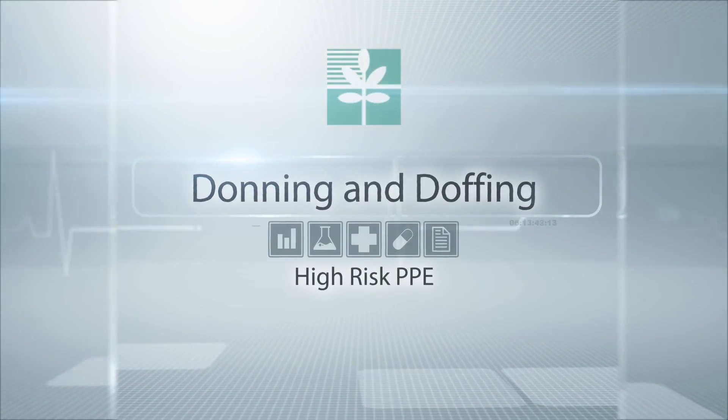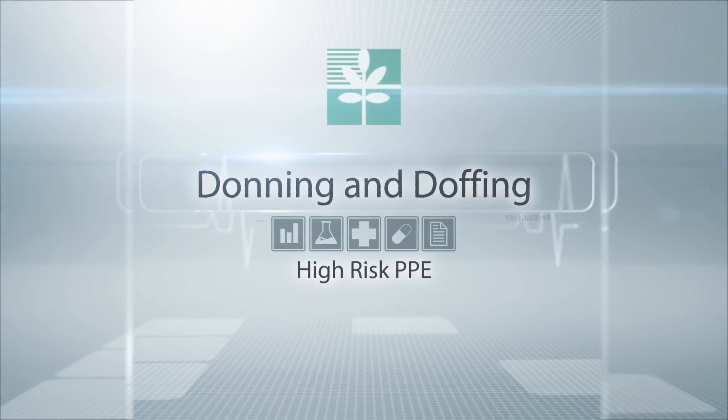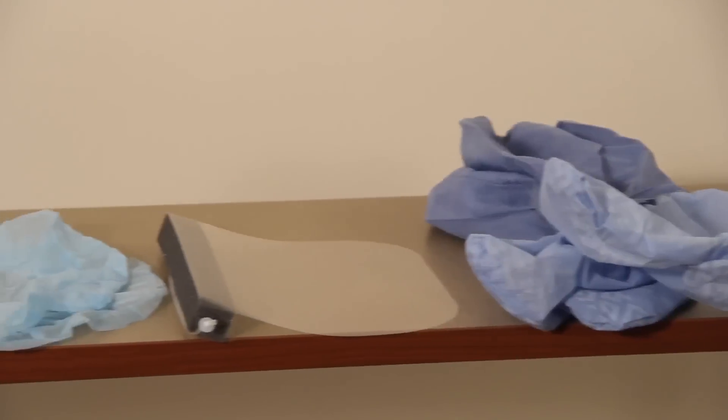Let's review donning and doffing the PPE for high-risk situations. First, you need the appropriate personal protective equipment.